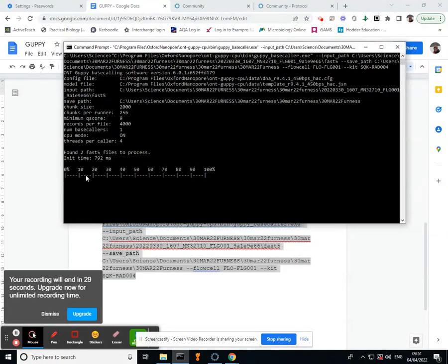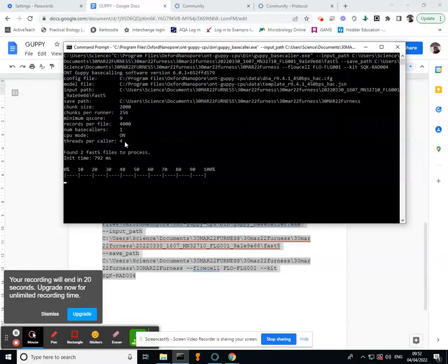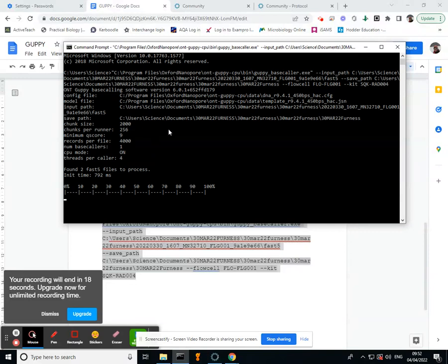Because I've only got a couple of files, it should be relatively quick. Just to rattle through it, threads is just how many different ways it goes in. You might have more, you might have less, but yeah, this is what you should see if everything's been done correctly.